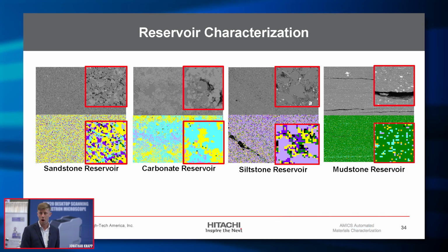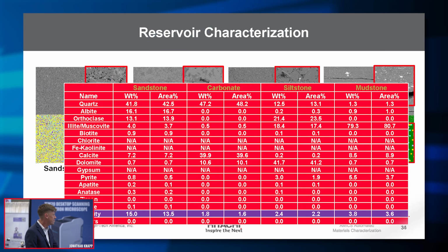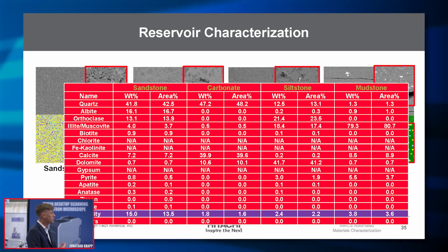I told you you're going to get one reservoir slide. So this is it. You won't have too much pain after this. These are all thin sections, and we can apply weight percent and area percent for each of the different phases.